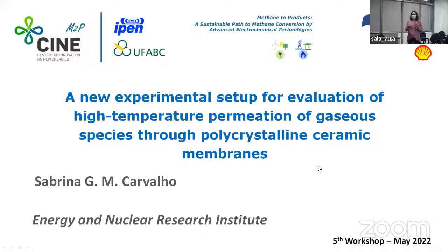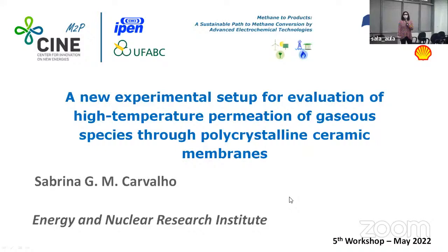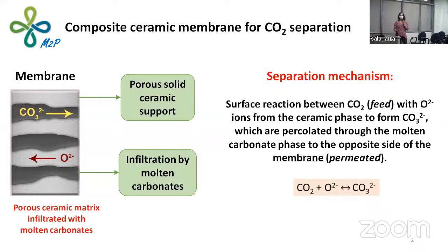Just one second. Okay. Hello, good morning. I'm Sabrina, and today I'm a postdoc at Project 10. I will present our experimental setup for gas permeation through ceramic membranes. Project 10 is responsible for developing composite ceramic membranes for CO2 separation. Before I present our experimental setup for permeation, I will briefly explain what this membrane is and how it works.